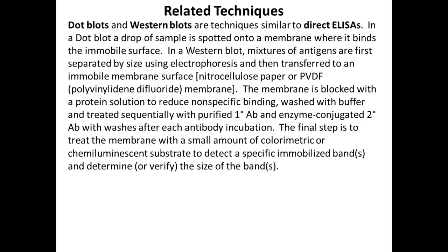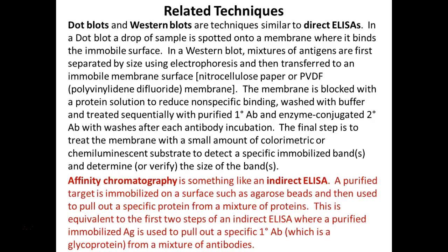So you'd have your antigen on your membrane, then add antibody solution to that membrane, shake it up in liquid, then take the membrane out and dip it in different wash vessels, then stick it in the secondary antibody and then your substrate, and then you would read your results. In this case, on the membrane, you'd see the different lines where the stuff you're looking for is. So lots of cool stuff.